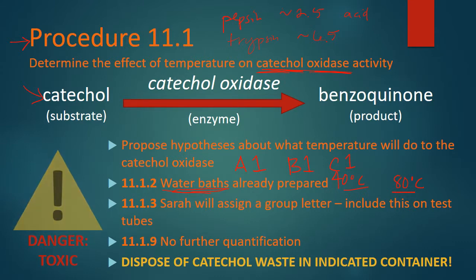Now you must wash your test tubes extremely, extremely well as well. And we're going to start this experiment first thing, before we even go over anything. I want you to start this because the lab manual prep sheet said it could take up to 2 hours to do this. I don't want to stay the whole 2 hours if we don't have to, so let's get it started ASAP.